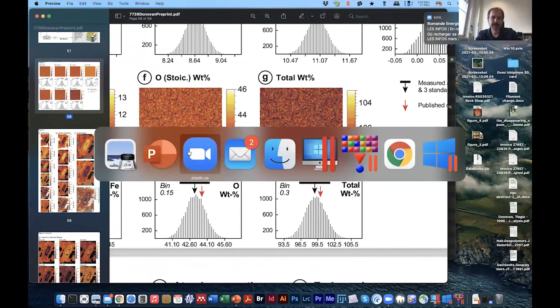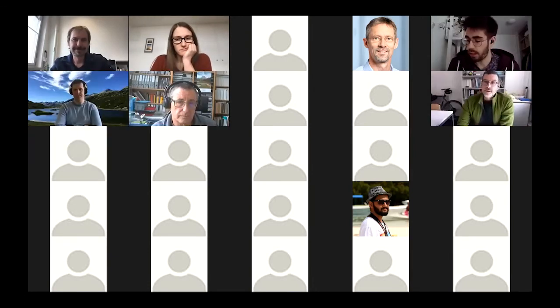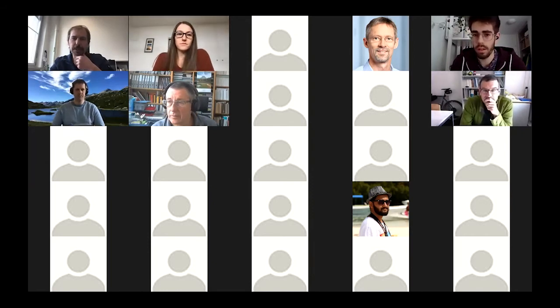Any other questions? I have one regarding the MAN correction and the 2 points background. So you said here that the MAN correction is better for the trace elements, right? It's better for everything.